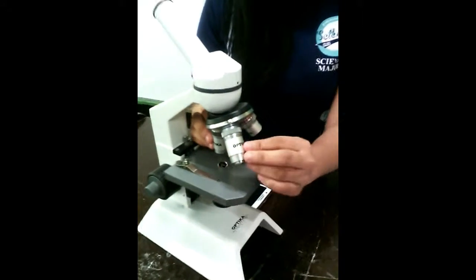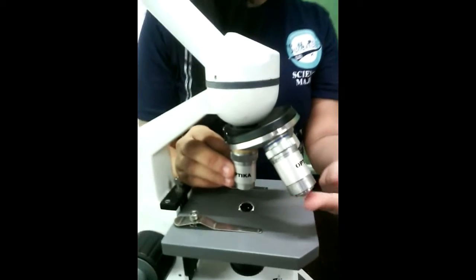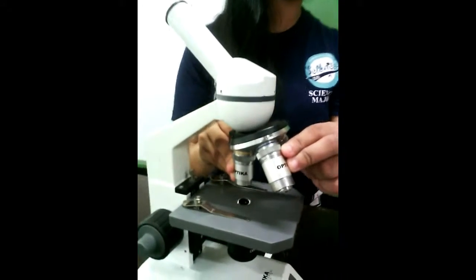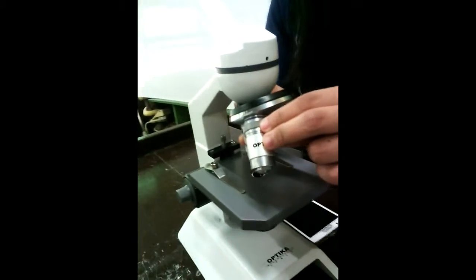The high power objective is a longer cylinder with a small lens opening. It is equipped with lenses of high magnifying power and is used to study the detailed parts of the specimen. It is focused by using the fine adjustment knob.